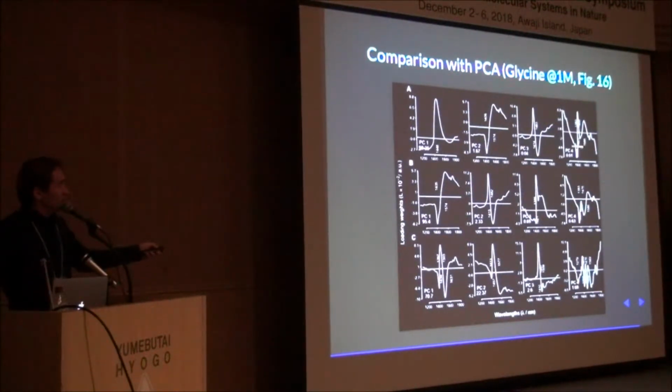Again, the second and third principal components are how many? This is 100. This is 4 orders of magnitude lower. Very uneven distribution, and there is a lot of temperature in the second. It is possible to argue that there is a water displacement. That's my understanding, that a lot of this is water displacement effect, and then mixed in between second and third are temperature and wavelength shifting.